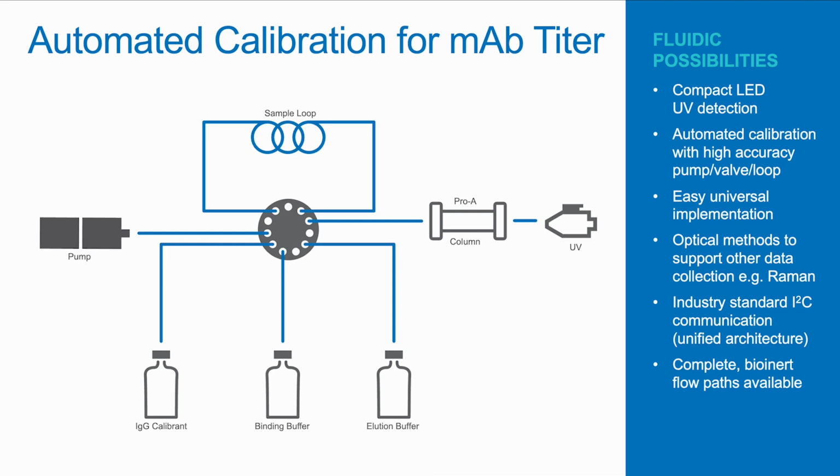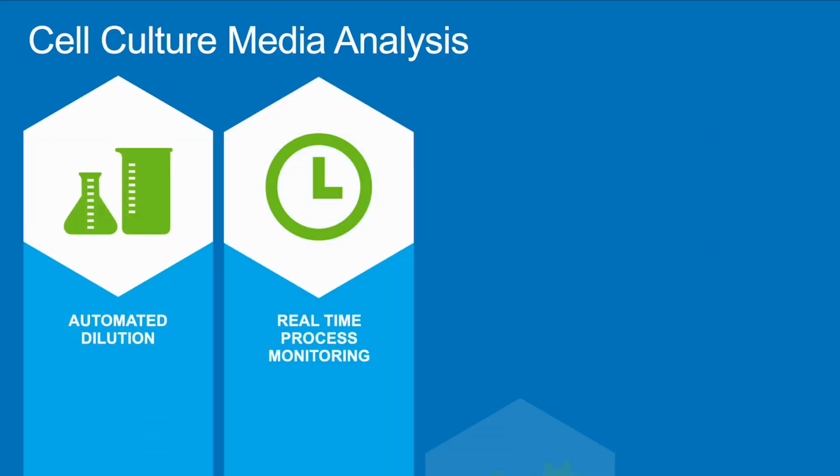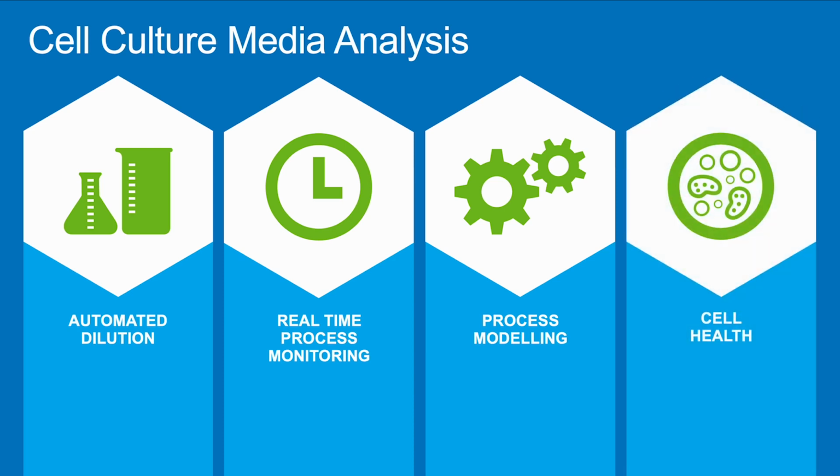Another important analytical workflow for increasing antibody yields during production is spent media analysis. Media optimization not only improves cell health and viability for improved titers, it can also improve product quality by limiting undesirable metabolic processes. Spent media analysis is important for process monitoring and modeling to ensure ideal growth for each cell line or clone. Although several analytical approaches may be utilized for spent media analysis, one of the key methodologies is UHPLC-MS-MS.